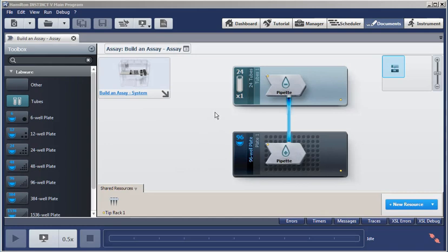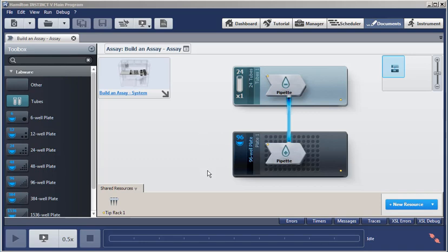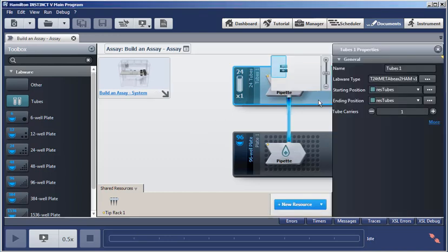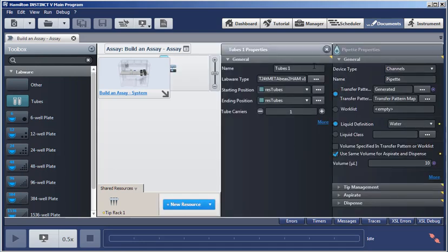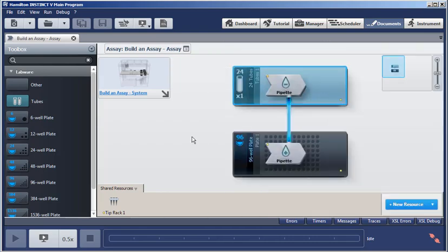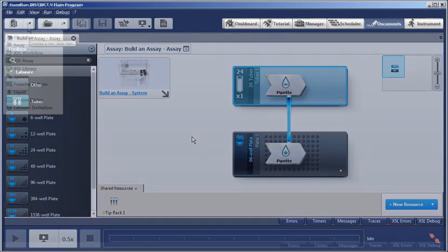Here's the simple assay created for this video. It picks up tips. It aspirates liquid from the tubes, dispenses into wells on the plate, and then ejects the tips into the waste. Notice the box at the top left. This is where the system document is selected. This is the one you just saw where the position resources were set. And double-clicking on either the labware items or the pipetting activity brings up the properties that you can set. So let's close these, and we'll walk through the steps to build this assay.